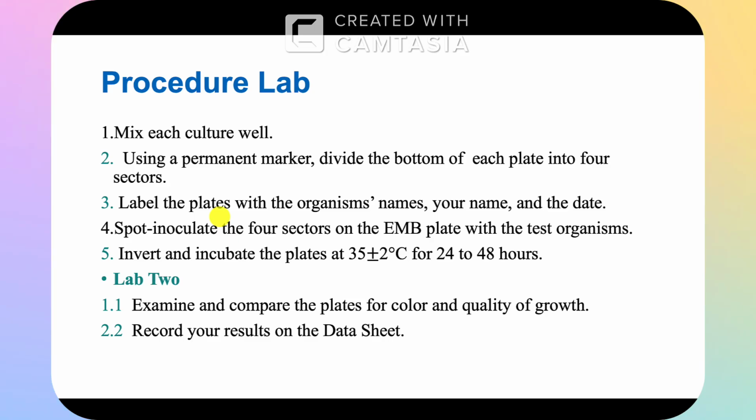The next day you will observe and check the colonies, do the indole test as well, and then record your results on the data sheet.